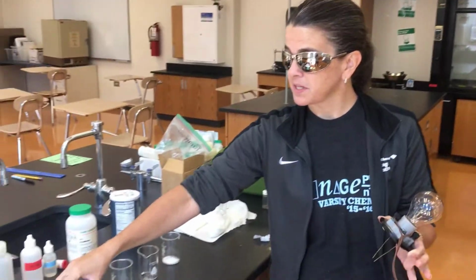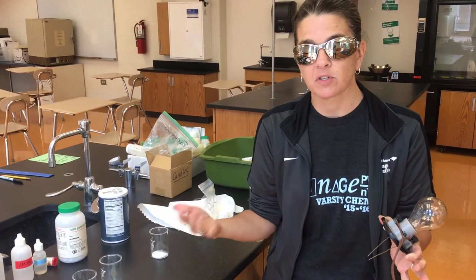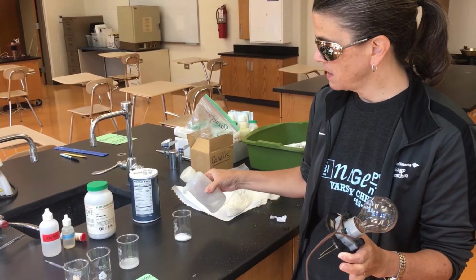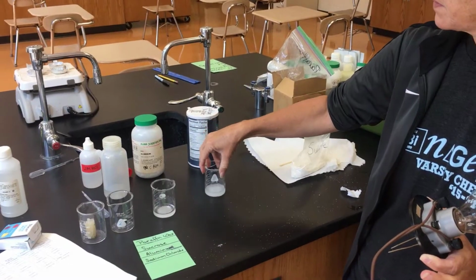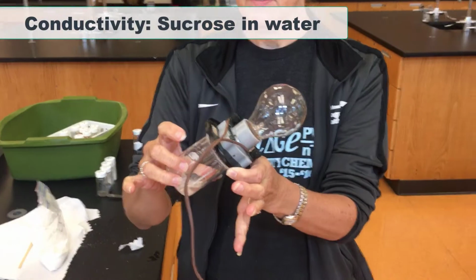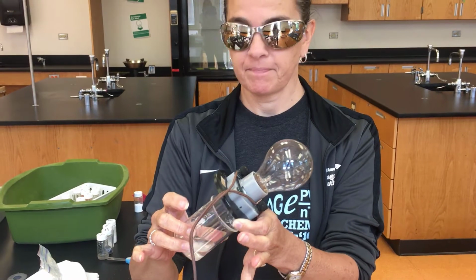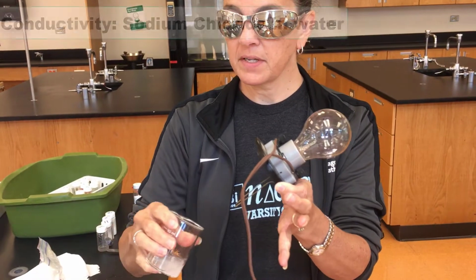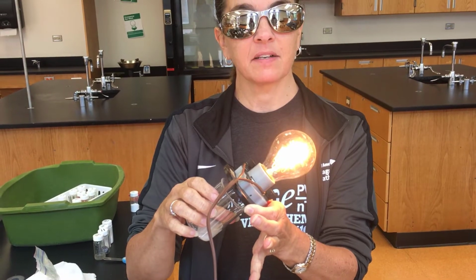Now, I'm not going to attempt to dissolve the paraffin and the aluminum in water because we already tested their solubility and they don't dissolve in water. So I'm just going to test the sucrose and the sodium chloride. And let's test our sucrose. And again, nothing happening. Okay, and finally, our sodium chloride solution. And this time we have some conductivity.